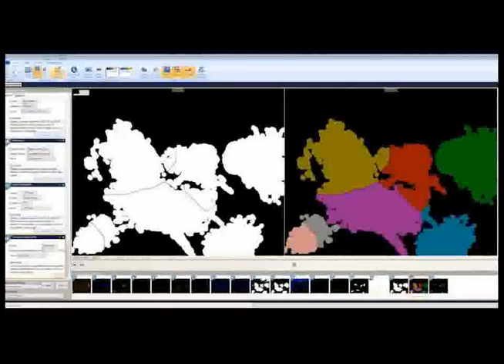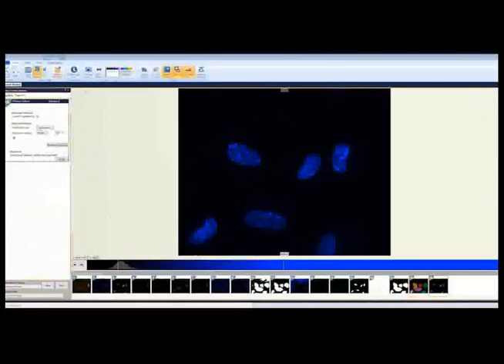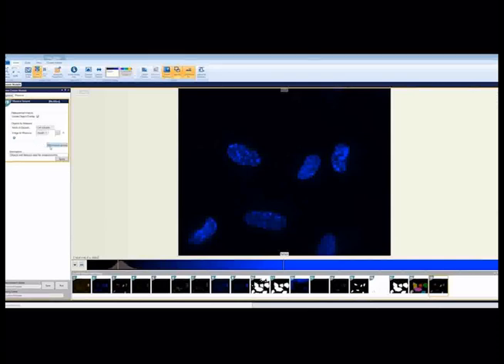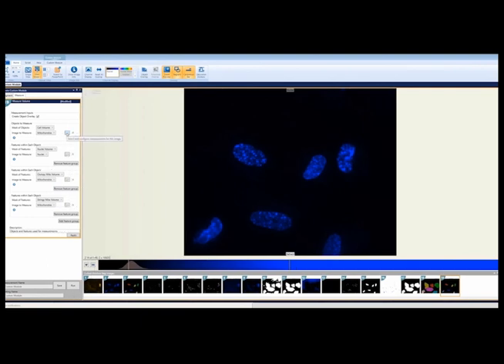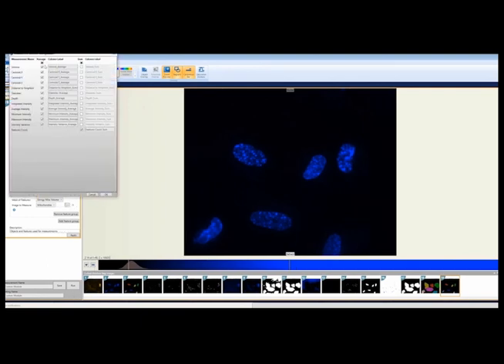The final step is to define what gets measured, what numbers to generate. To do that, we switch to the Measurements tab, select our cell volume map as the object mask, and then proceed to add additional feature masks for each thing within the cell that we want to measure, namely the nuclei, stringy mitochondria, and clumpy mitochondria. Assign which images to measure and with which mask.